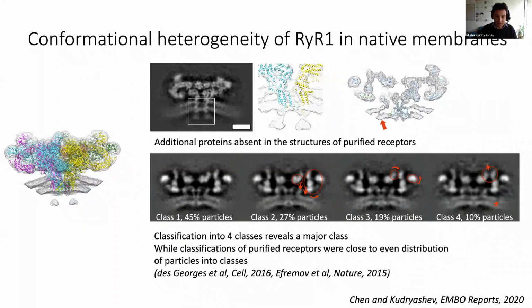membrane. So in native membranes, it can contain interesting combinations of lipids. And so obviously, for some reason, it also bends the membrane, and we don't understand why so far. But in order to understand this a little bit more, we would want to have all those classes to be at higher resolution.